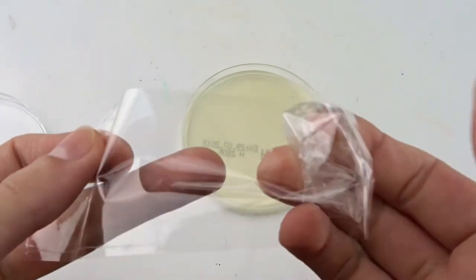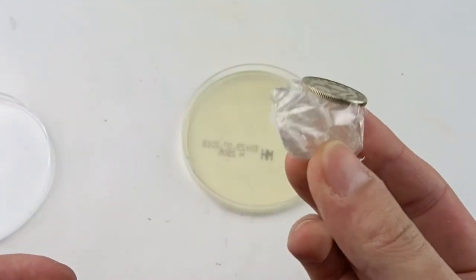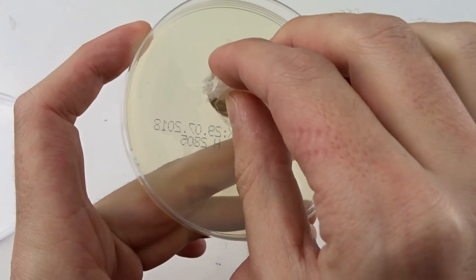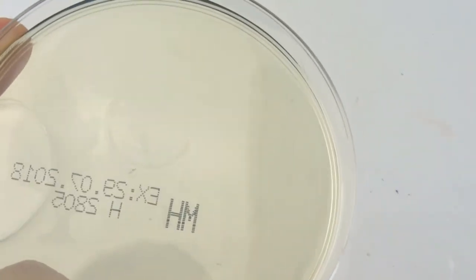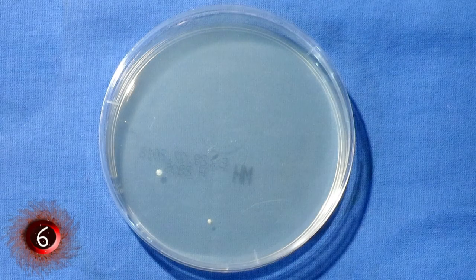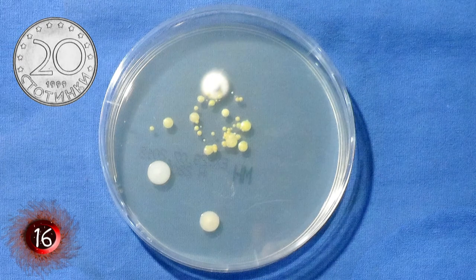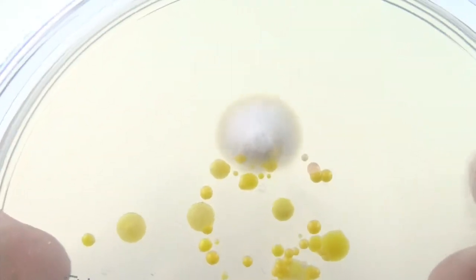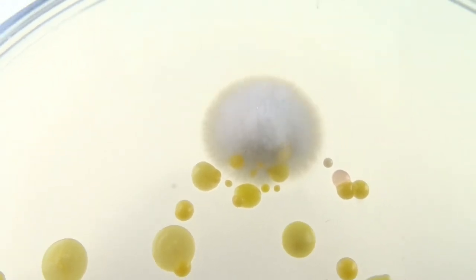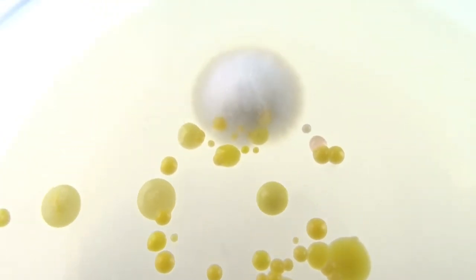Then I decided to try with a coin, so I stick the coin to a ball of scotch tape and press it onto the bottom of the Petri dish. And now with my fingers.